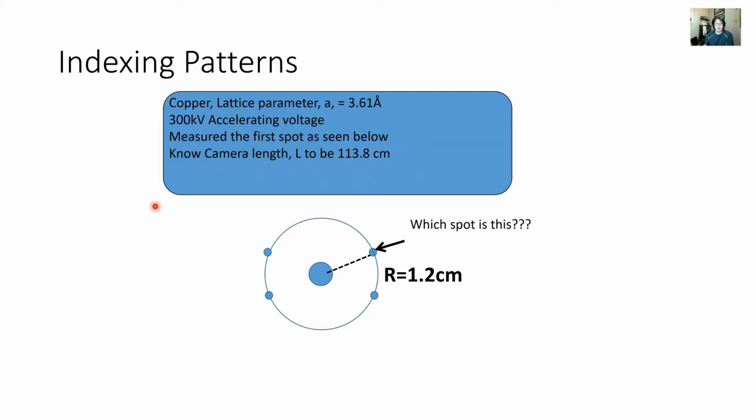And let's go through the question here, what we're trying to answer, which is: which spot is this? Oh, okay, so now we're indexing. If you remember on XRD, we had diffraction spectra. Let me try to draw it a little better. I'm almost embarrassed at myself. So we had 2 theta, and then we had intensity, and then we had some spectra.